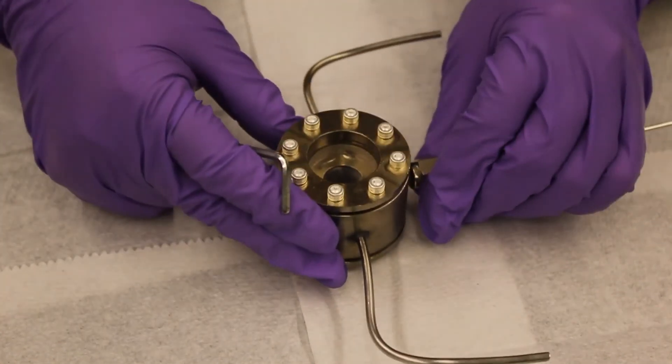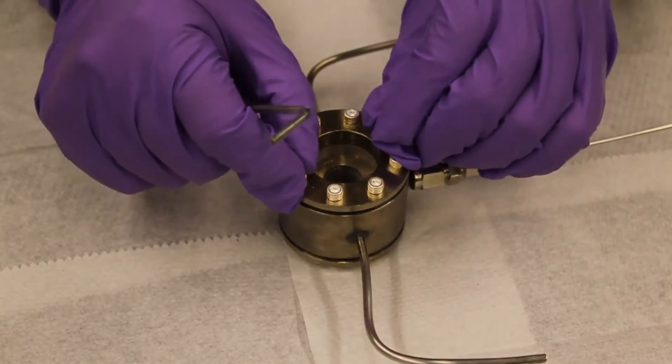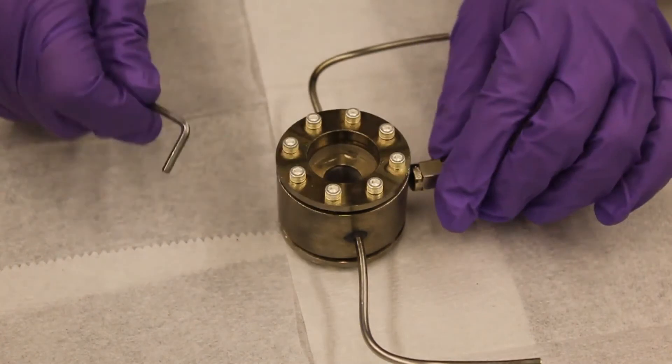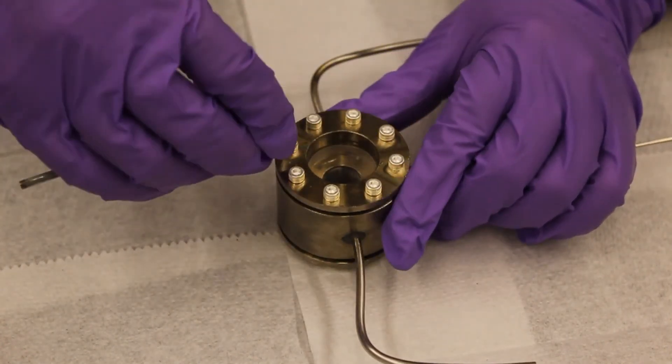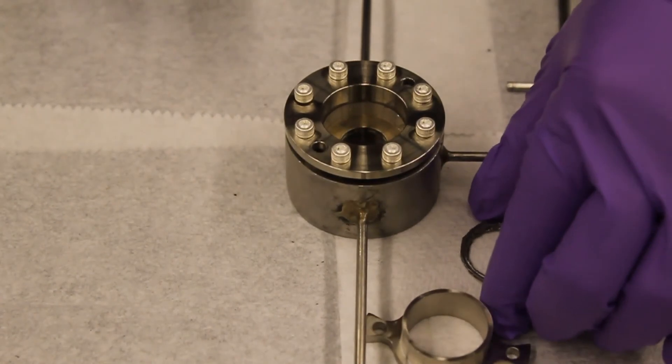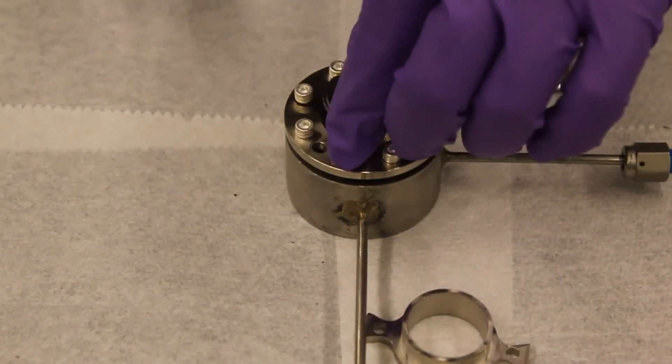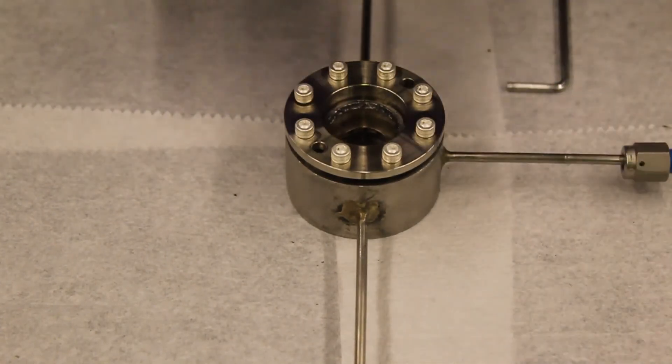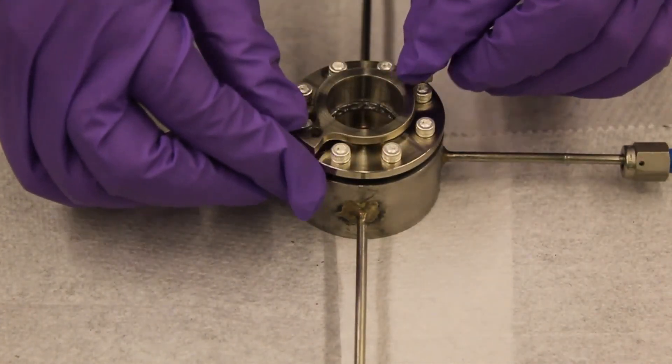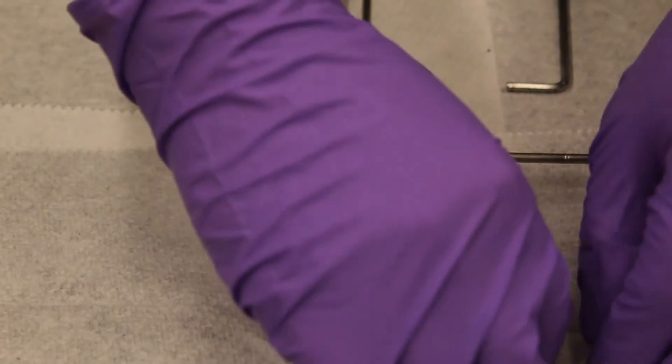Repeat the same steps for the other side of the IR cell. In this case, we use silver-plated screws to avoid the need to use anti-seize agent. Place the window retainer on top of the calcium fluoride window with just enough pressure to hold the window in place.